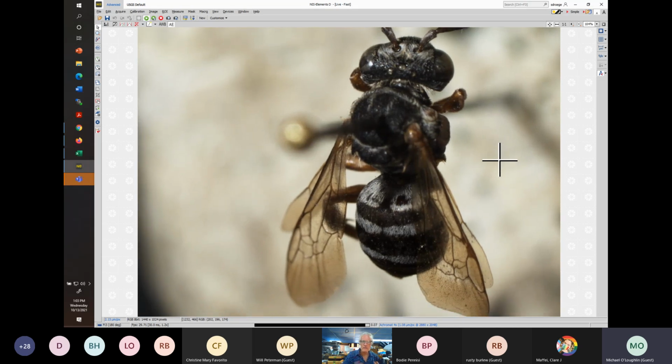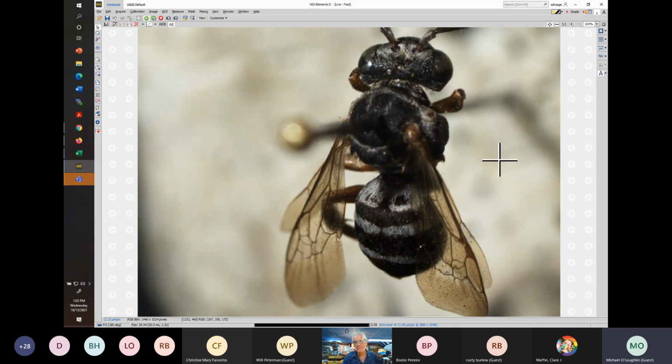Okay, so in general, when you look at this bee and Epeolus, what you'll be seeing is a lot of appressed hairs. So these white bands of appressed hairs. This is not maybe the best model. Let's see if I can get the white balance a little better, and maybe some of the focus. Okay, but it's a little bit dirty, as many of our specimens are.